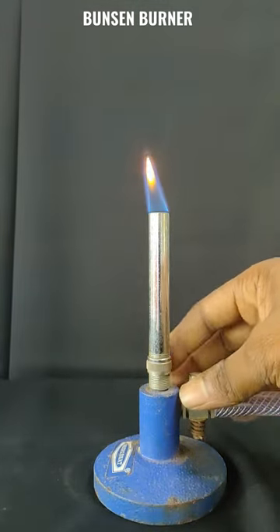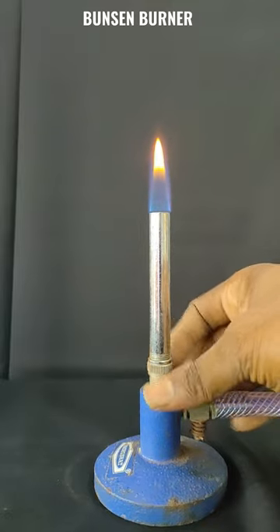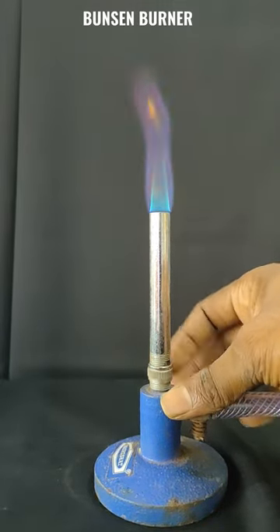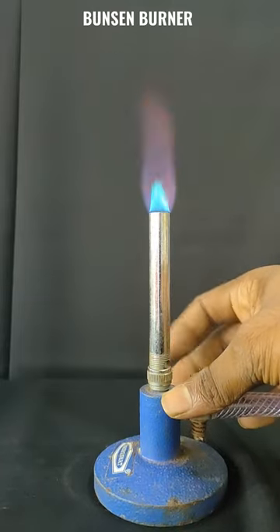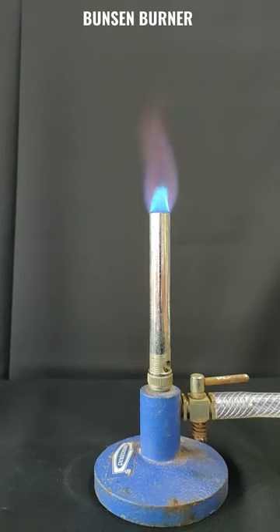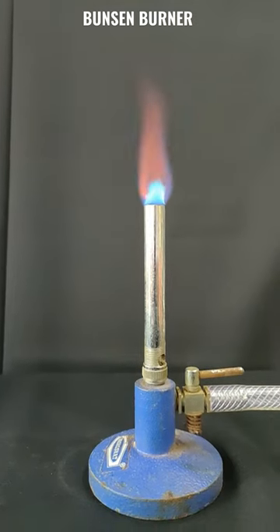After this, we can open the air holes to get a bluish flame. This is the scientific method to turn on a Bunsen Burner.